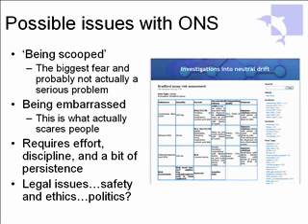So we weren't putting this in, and arguably that is against, again, you know, this is information on how the experiment is done, so we should have been putting it in. I had a postdoc come in to do a few weeks' work on a project, and she said, well, it's a lab book, it has to have the safety information, so it all went up. And I saw this going up, 15 minutes, half an hour after it happened. I was off-site that day, and I thought, what if someone looks at this, uses it, and manages to injure themselves?